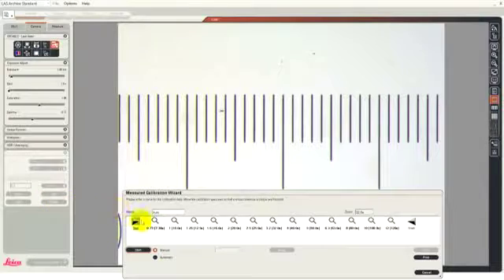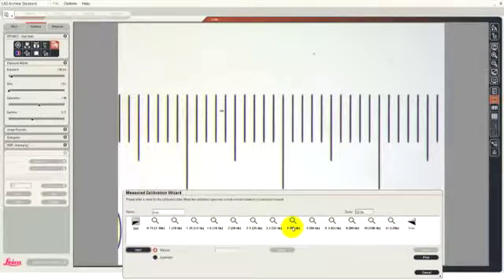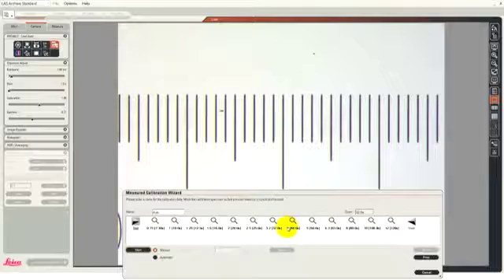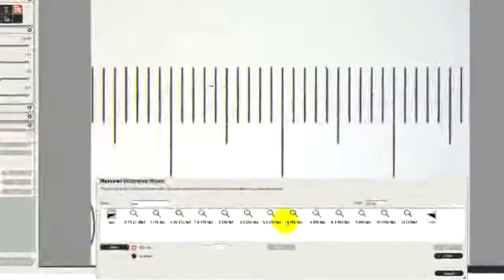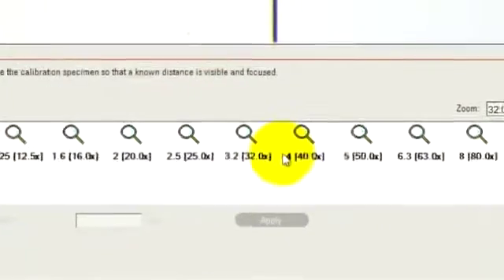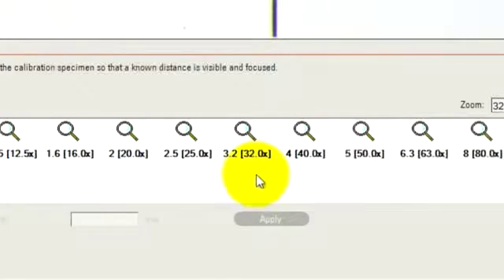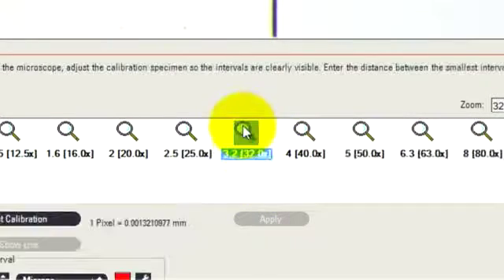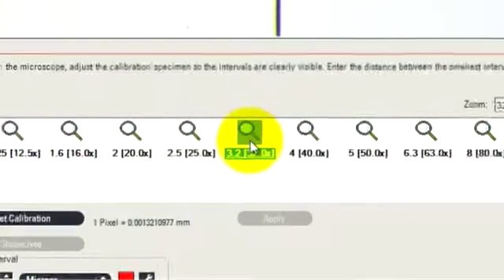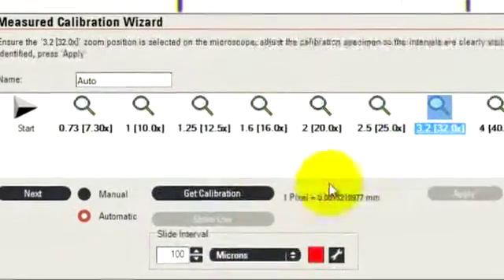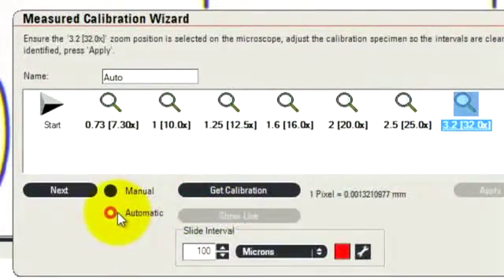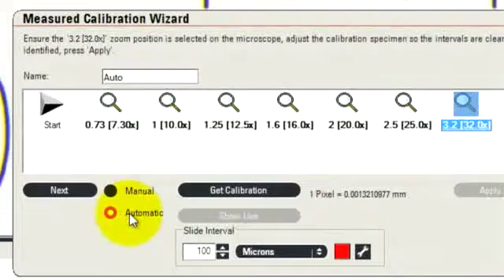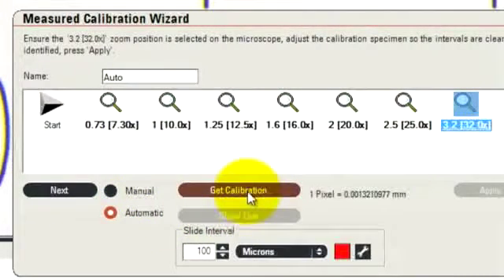You can see that there are many zoom positions on this microscope. The one that we've got selected at the moment is the 3.2. So let's see how we can calibrate the 3.2 value. I click on the zoom position and I can now see that I've selected the automatic method of measuring the calibration.